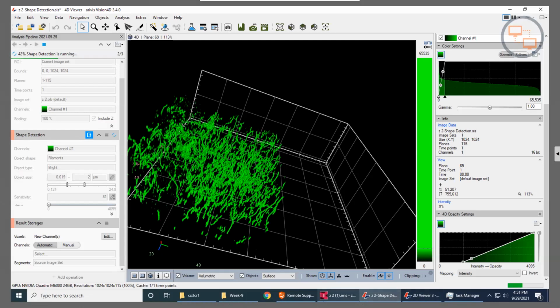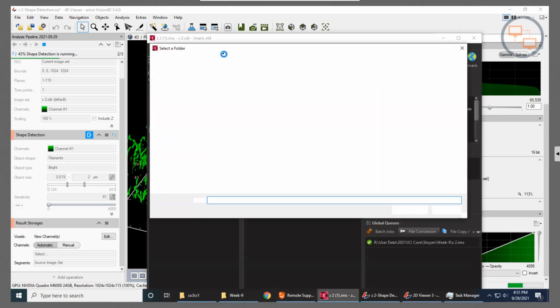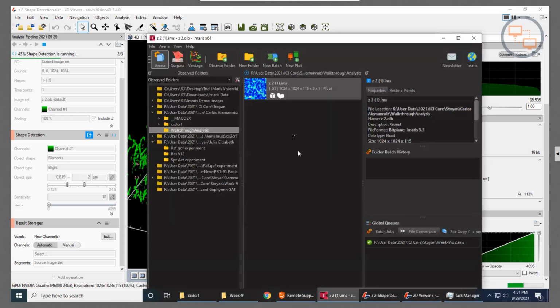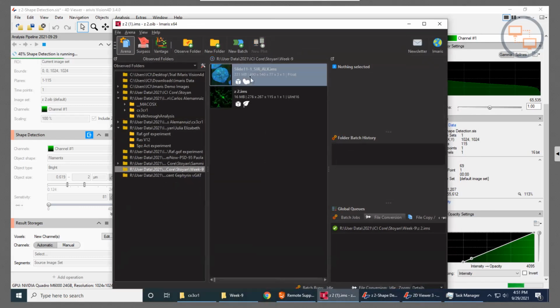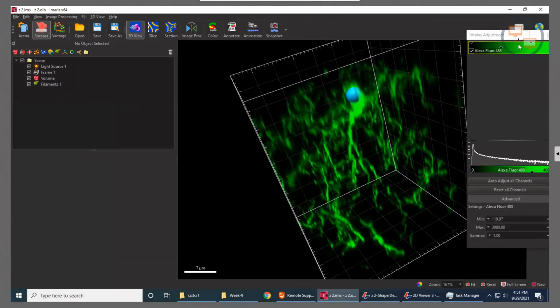Yeah, that kind of calculation. Yeah, you can do that kind of calculation with Imaris pretty well.